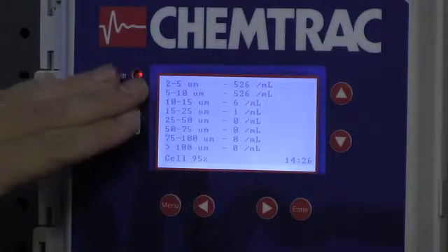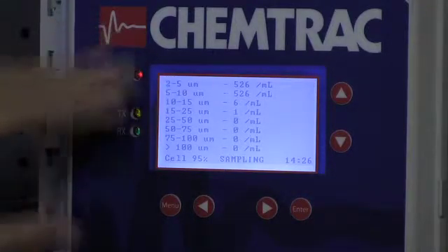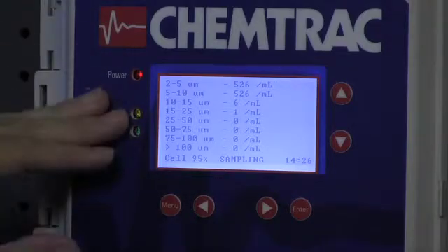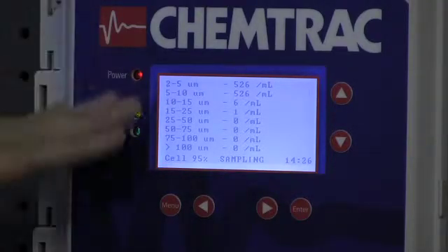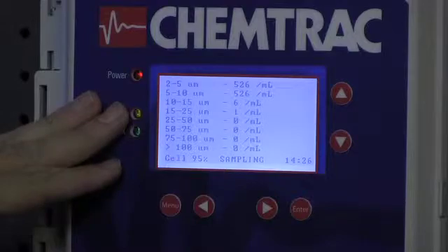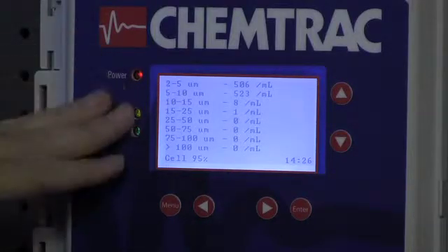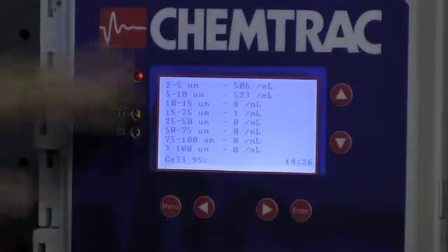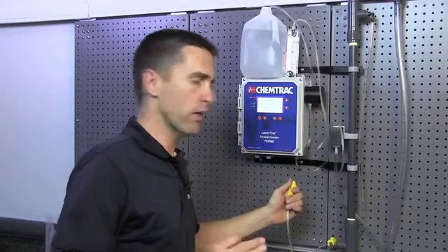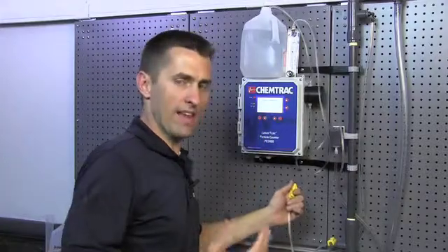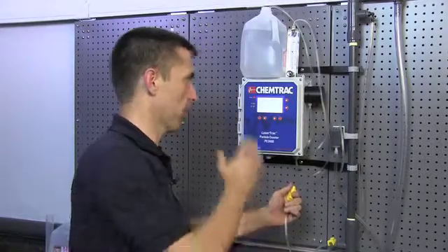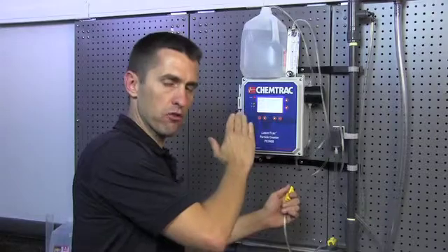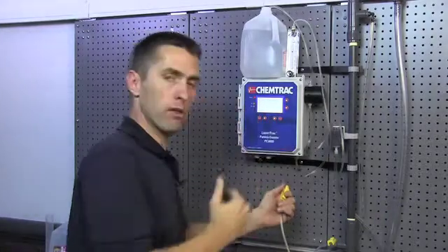So now we can see we have a perfect split of 526 and 526, so an even 50-50 split. Of course, that won't stay the same, as it will update, we'll see that the values will change slightly. But we have what appears to be a very good calibration on the 5 microns. If you wanted to make small adjustments to the actual calibration, that can be done. For all intents and purposes, this is well within accuracy requirements in terms of the kind of split that we're looking to get.